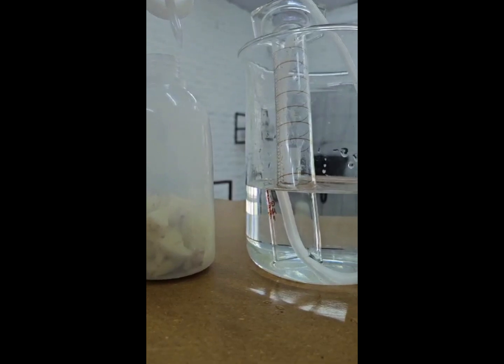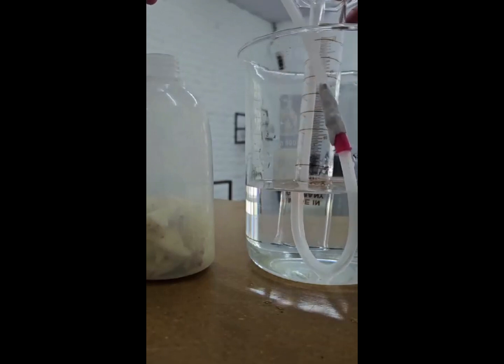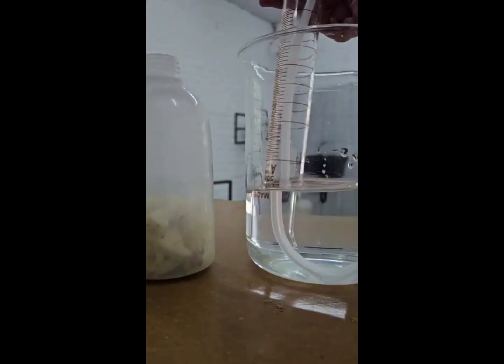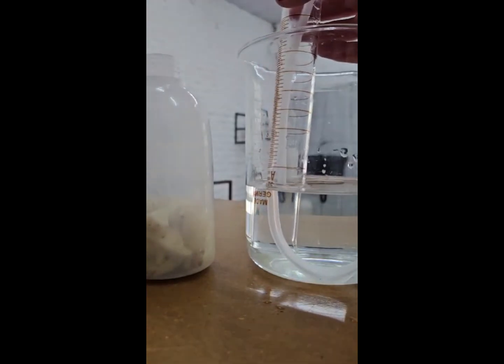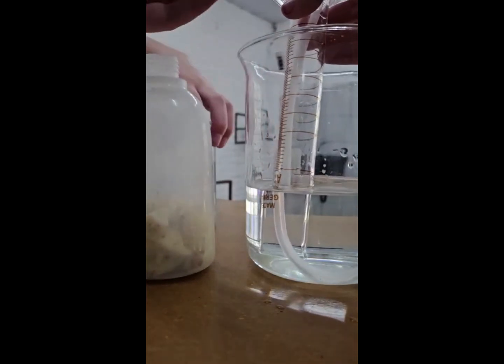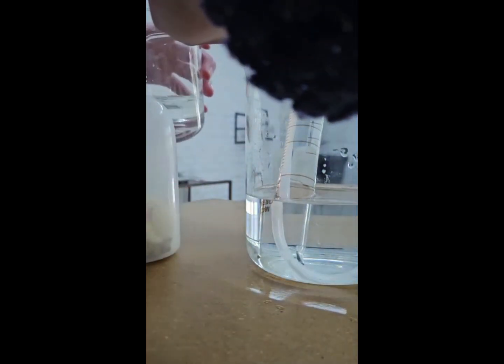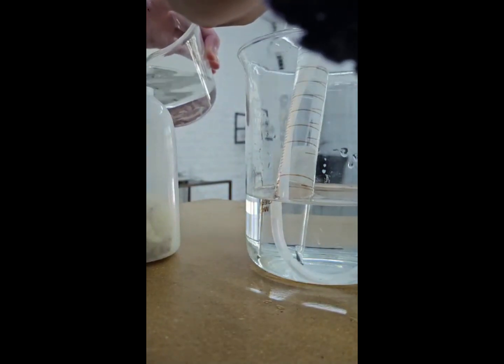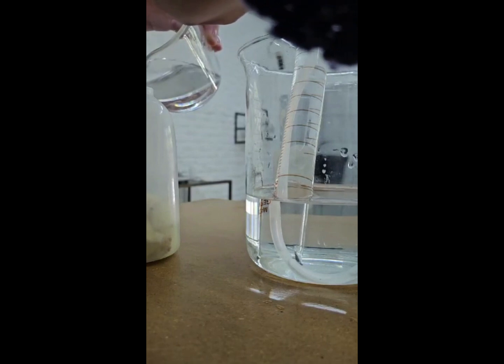Catalase likes working at a pH of 7, so I used a buffer solution to keep the enzyme reaction at its maximum. I then removed all of the air from my inverted measuring cylinder to be able to capture the oxygen that would be produced. I then added the hydrogen peroxide to my potatoes and sealed the container really quickly so that no air escapes.